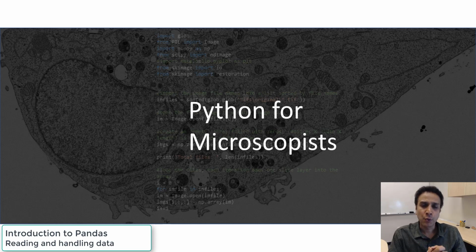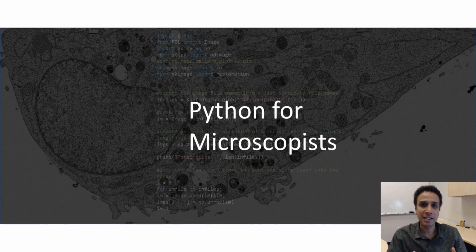In the last couple of lectures, we talked about grain size analysis, cell analysis, where we successfully separated individual cells or grains, using watershed and also traditional segmentation. And the result, we dumped it into a CSV file. Now, let me take a couple of videos, to explain how to deal with these CSV files from within Python.